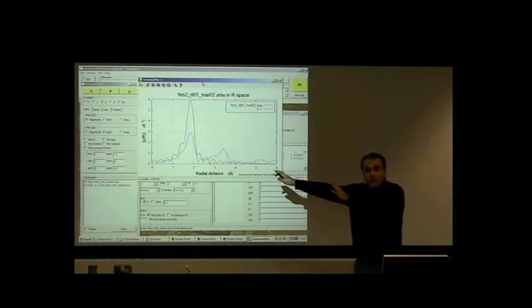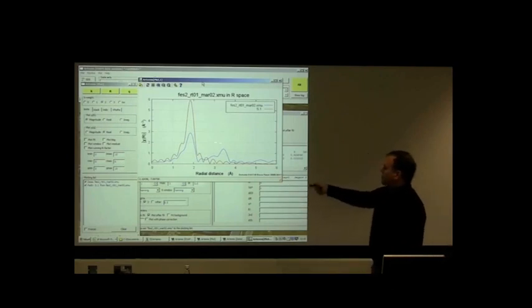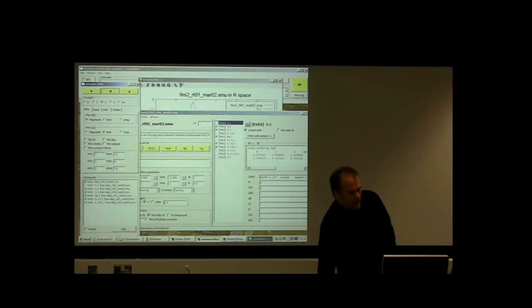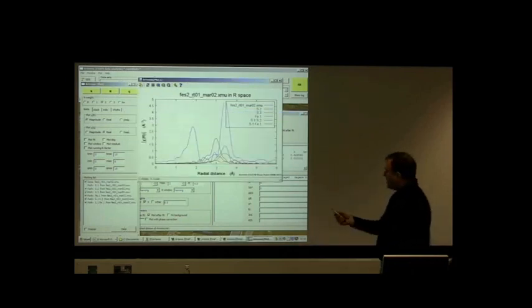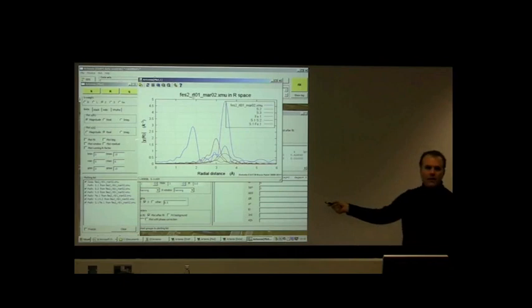And we've also learned that there's a whole bunch of things that contribute spectral weight underneath this peak. At the very least, I think we are going to need to consider these single scattering paths and these two multiple scattering paths. At the very least, we're going to have to consider those. So understanding this blob here is going to somehow require figuring out how to include at least these 5 things into the fit.